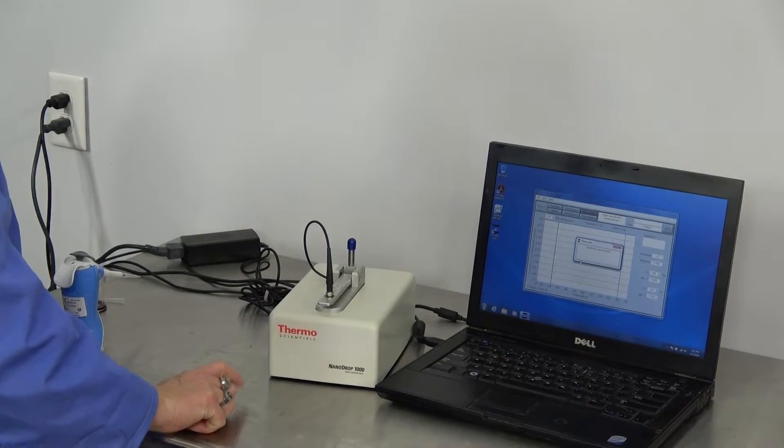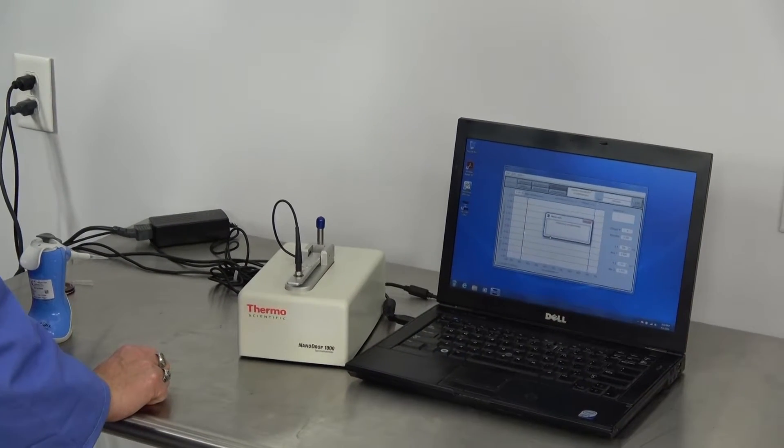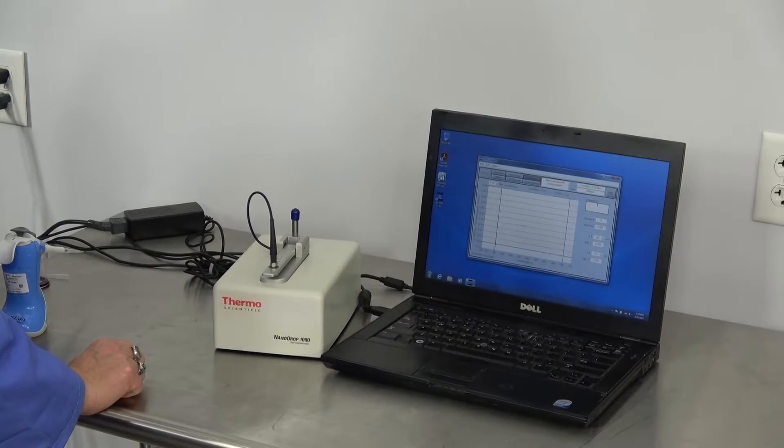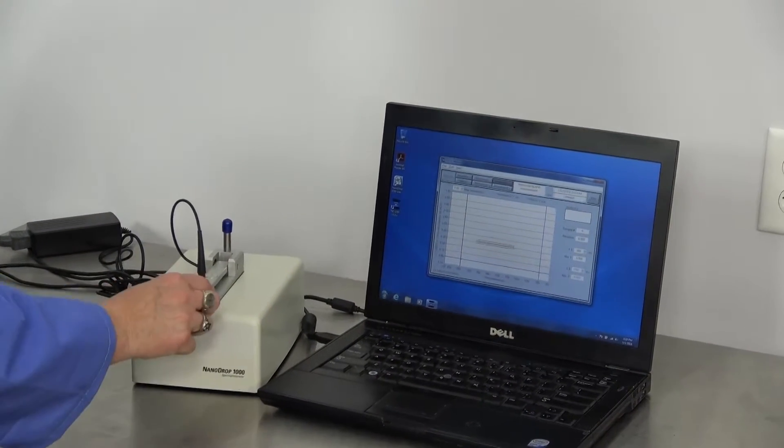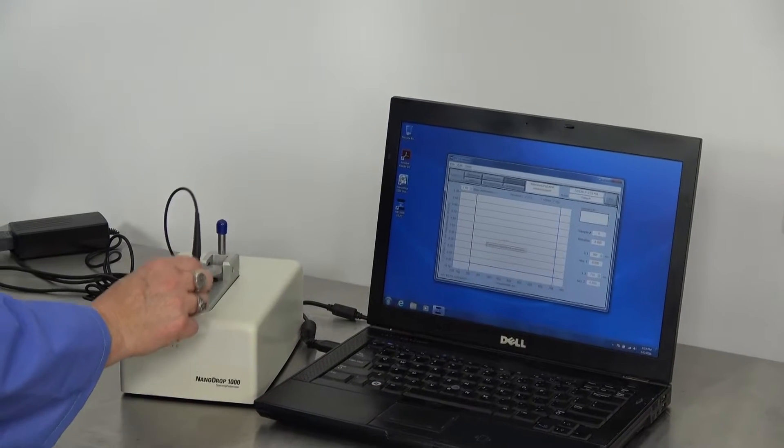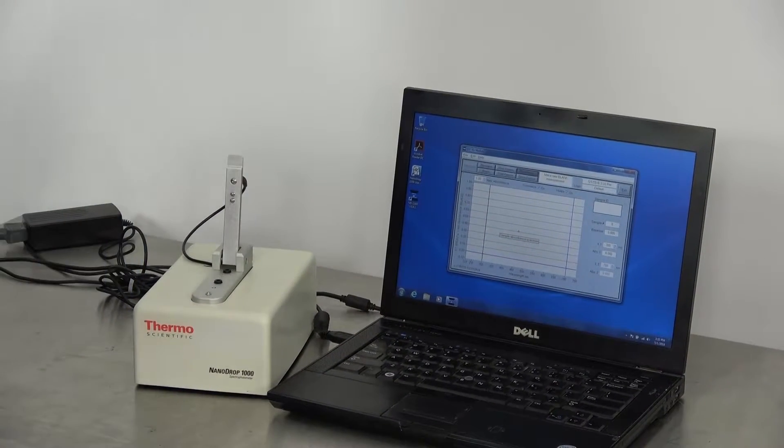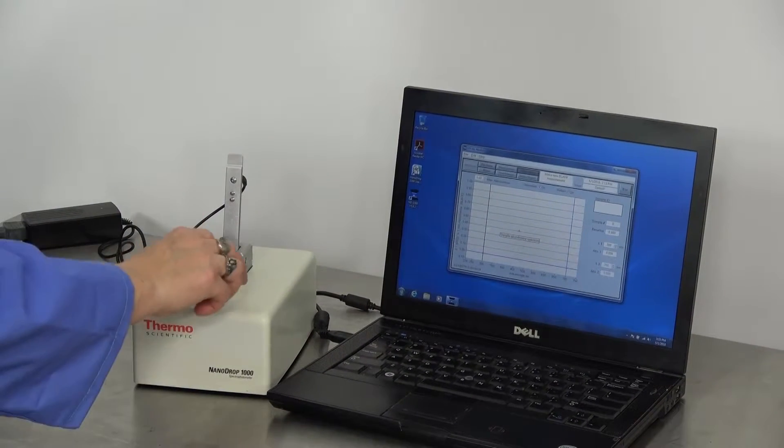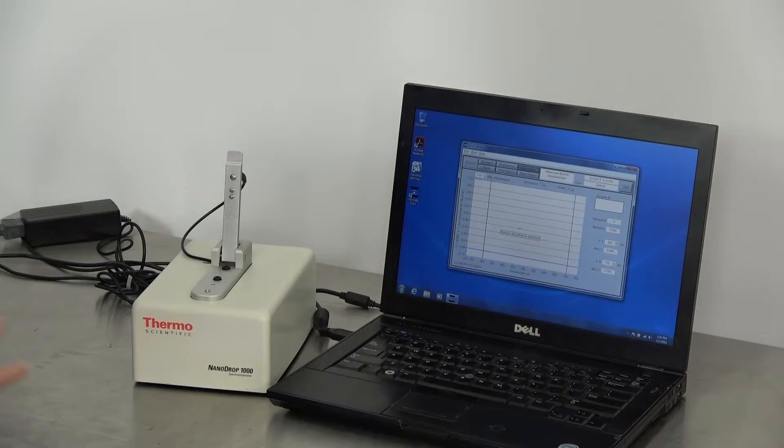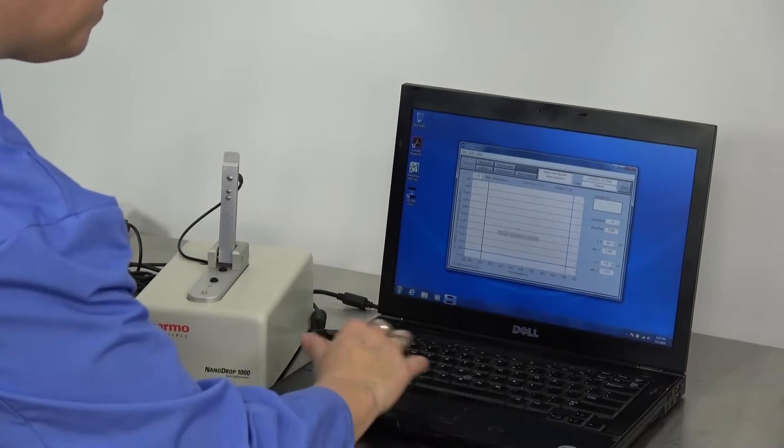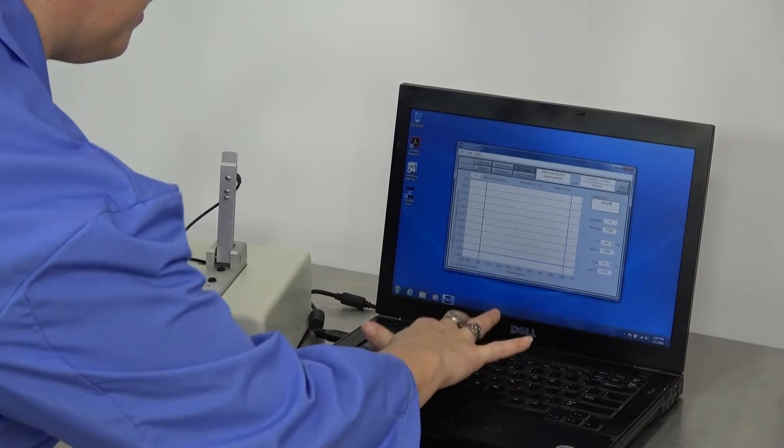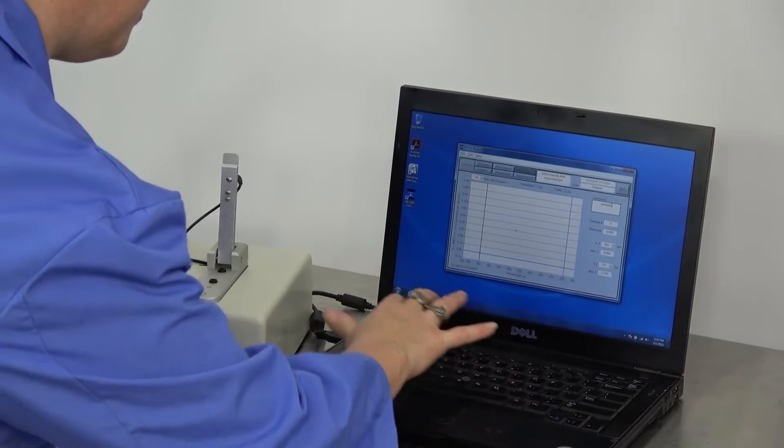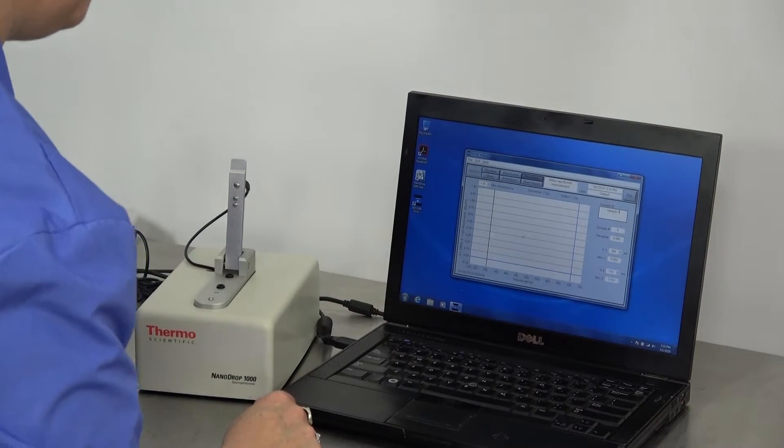That clicking indicates that it is working. It is initialized. First, we'll go ahead and tap off the moisture with our lint-free. Type in the sample.